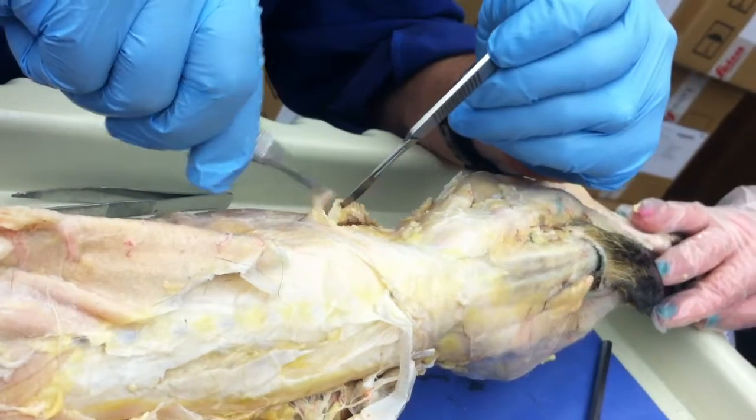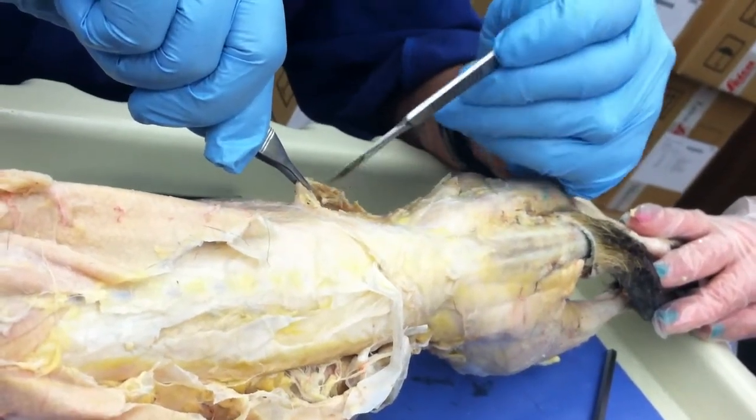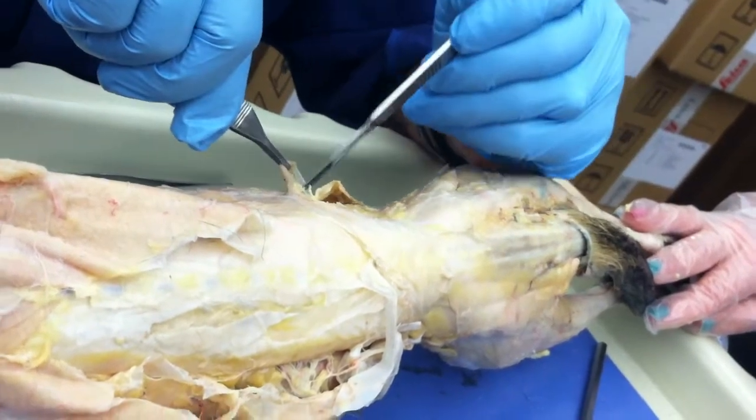External oblique, internal oblique, transverse abdominus — and that kind of shows them. External, internal, transverse abdominus.